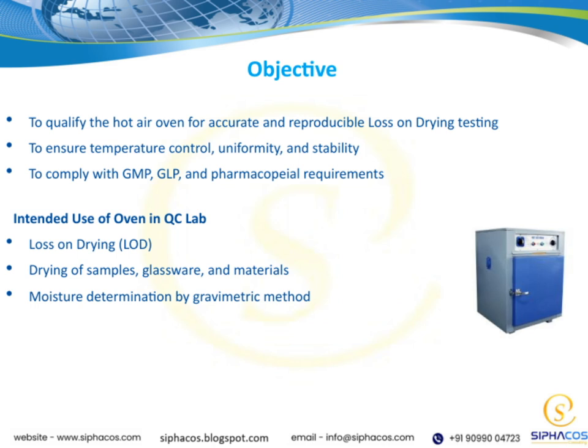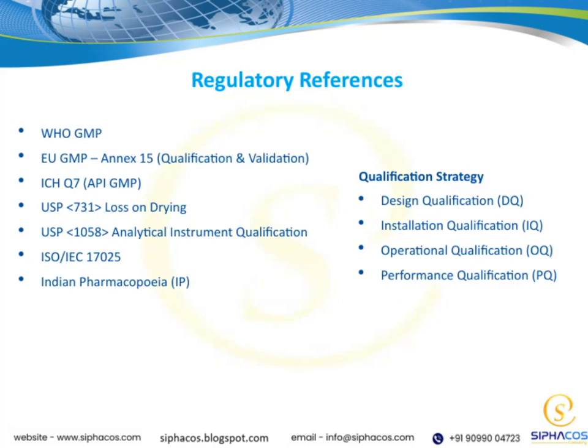So, in summary, this oven is a critical instrument in our lab for ensuring our products meet strict quality standards, and proper qualification is essential to maintain its performance and compliance. Let's take a closer look at our qualification strategy.